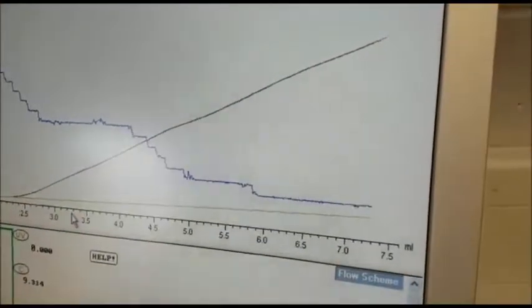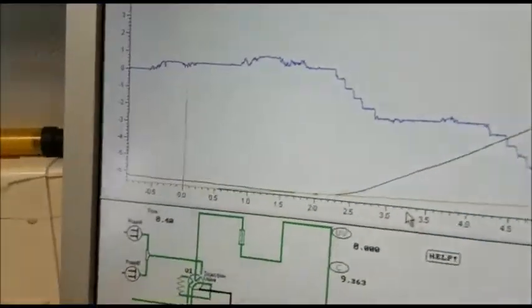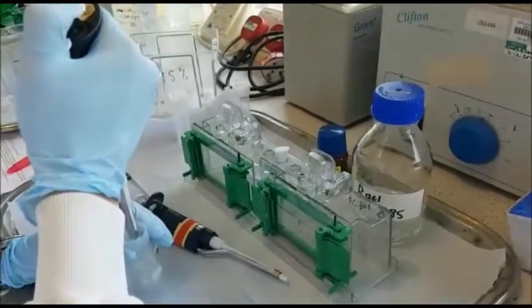The reason behind isolating the proteins was to be sure that the effect that they have is their own and not a different protein. After each chromatography step, I would take fractions and analyse the trace produced.